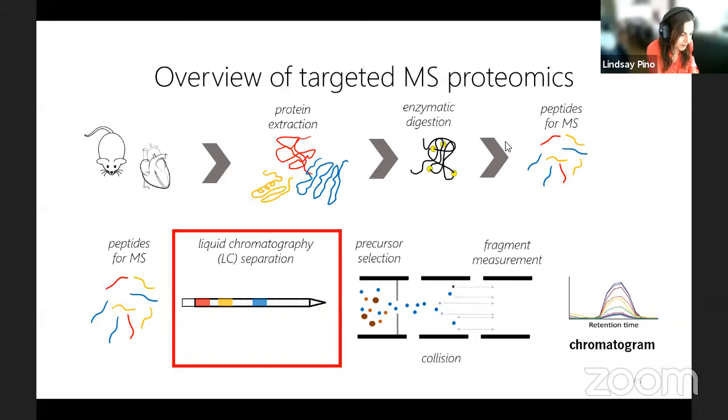What if I am only interested in the intracellular part of the receptor that has a limited amount of peptides? I have to compare abundance between different cell lines. So the good news is, if you have a transmembrane protein, one of the challenges in mass spectrometry is that sometimes we fail to detect transmembrane domains of proteins. And this has to do with the hydrophobicity thing I was talking about with liquid chromatography. Transmembrane domains tend to be very hydrophobic anyway, and measuring extremely hydrophobic or extremely hydrophilic peptides by conventional mass spectrometry is tricky. So your intracellular part of a protein is the part that you would probably measure by mass spectrometry anyway. There are products and approaches out there to get more of the membrane-bound proteins, but that's maybe a talk for another day.